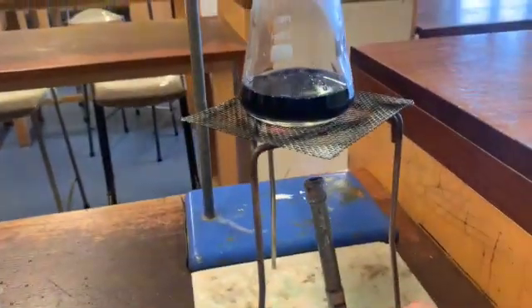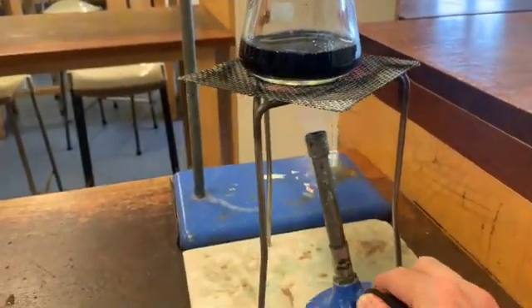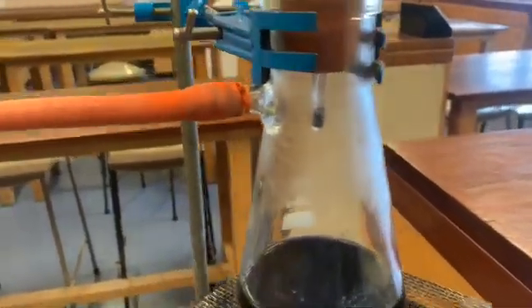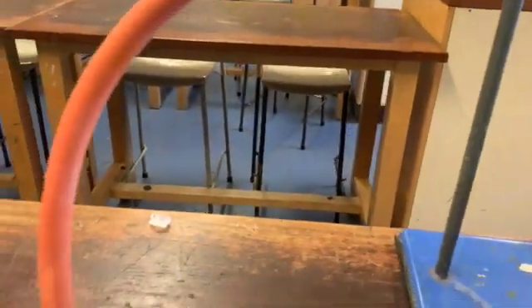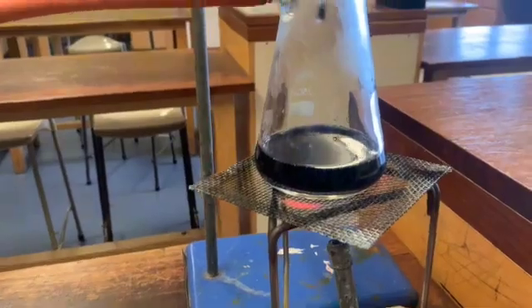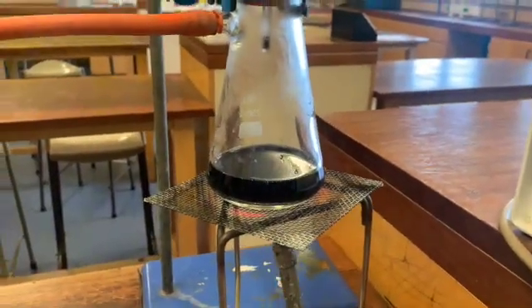Basically, what we're trying to do is heat this up here and get the water to evaporate. The water will evaporate, hopefully travel down this orange tube, and end up in the bottom here. I'm going to stop recording now and I'll come back when I've got this on a good boil.